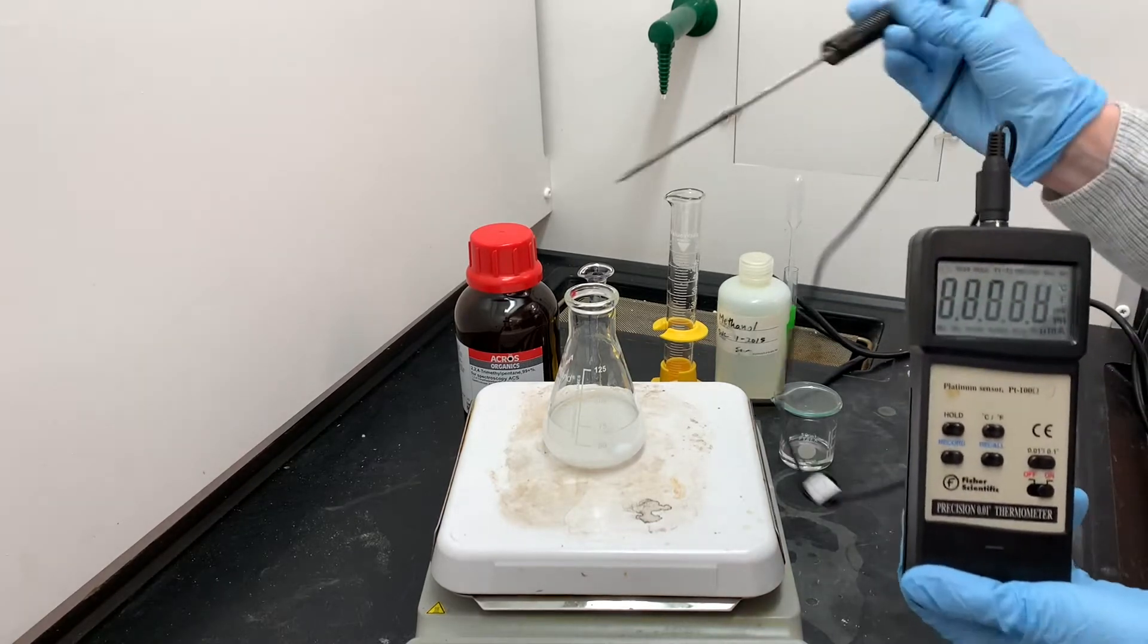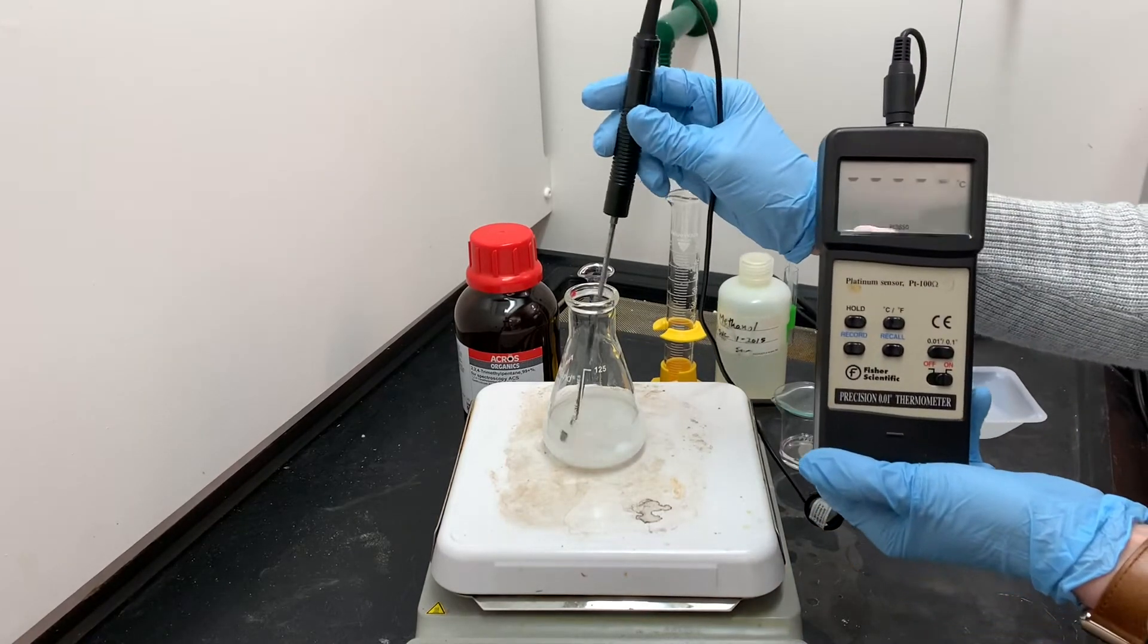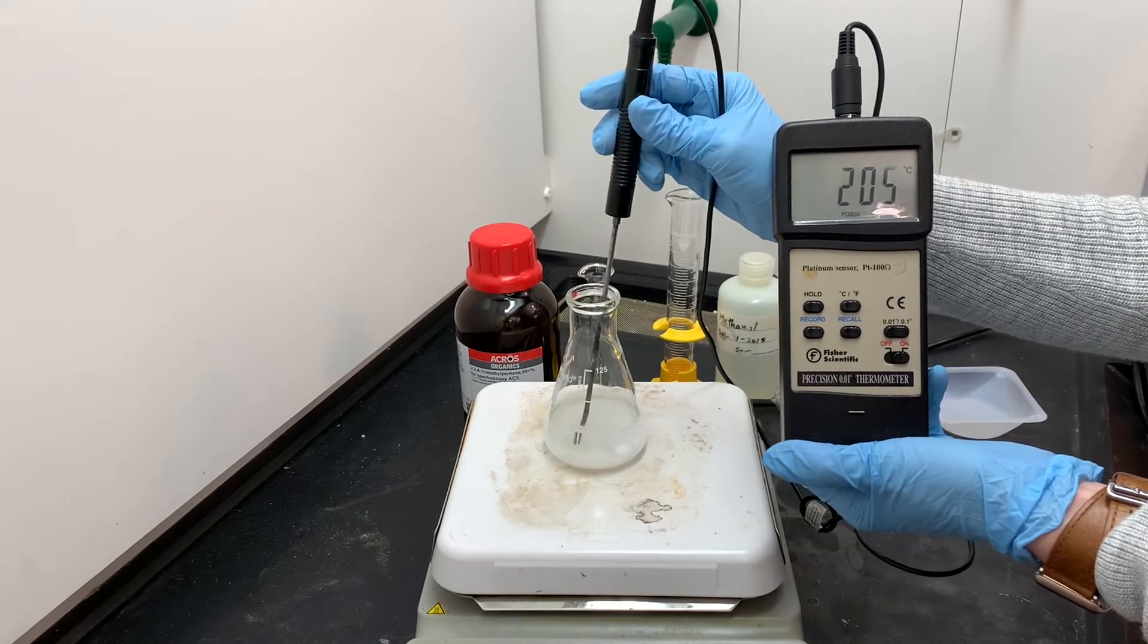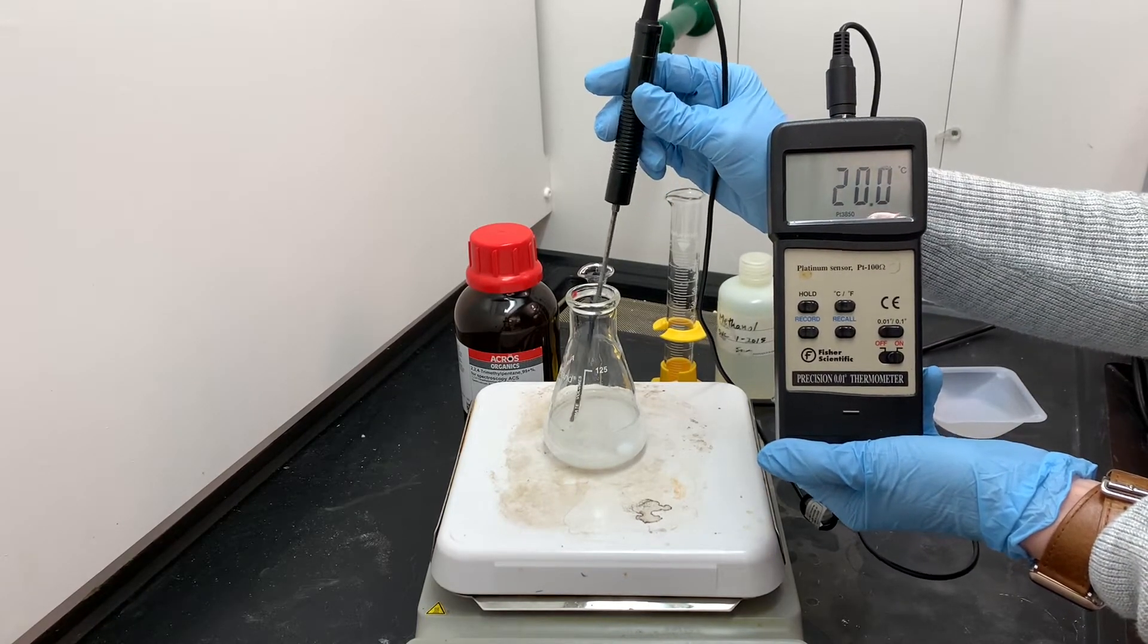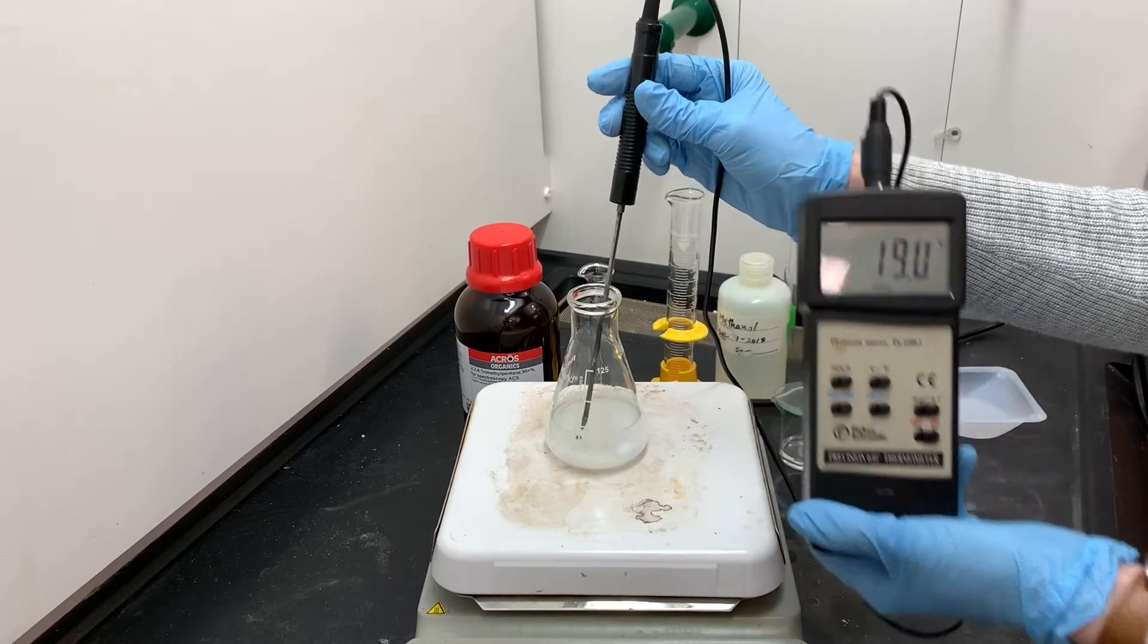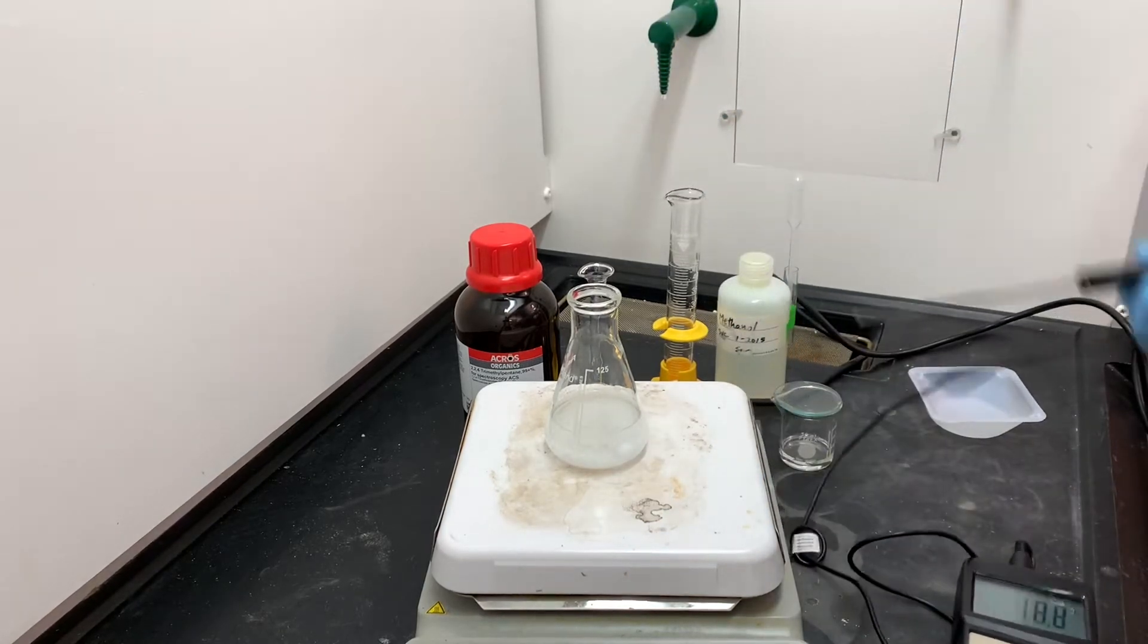While the urea is dissolving, I'm going to monitor the temperature of the solution just to make sure that I don't get up to the boiling point of methanol. Methanol boils at about 65 degrees Celsius, so I want to try to keep this solution around 55 to 60 to stay pretty far away from the boiling point.